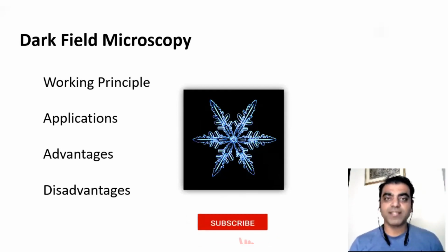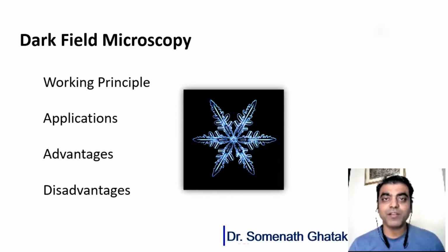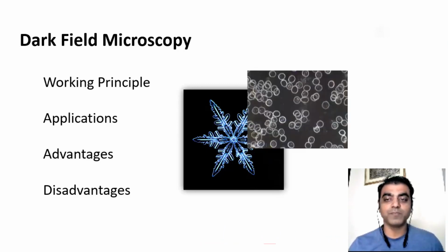Today we will be discussing dark field microscopy. We will see the working principle of dark field microscopy, the various applications, advantages, and also the disadvantages associated with this particular type of technique. So to start with, first the working principle.